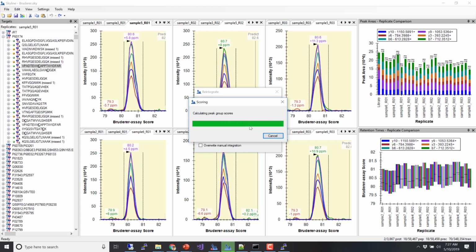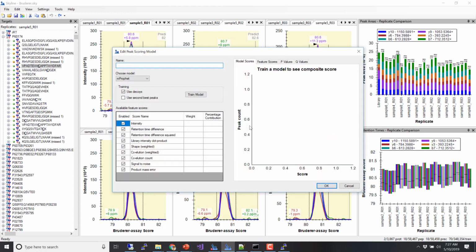That's our starting point. We're trying to control the error in our starting point. And the next thing we're going to try to control our error in is our peak picking, right? We're going to try to do the best job we can possibly do on picking peaks. But if we see something that was really low abundance and we're not sure that we were able to pick it, then we need to know that's not a value we trust.